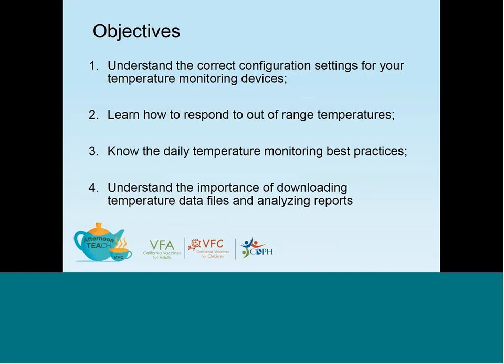At the conclusion of the webinar today, you should be able to understand the correct configuration settings for your temperature monitoring devices, better known as a digital data logger, learn how to respond to out-of-range temperatures, know the daily temperature monitoring best practices, and understand the importance of downloading temperature data files and analyzing reports.